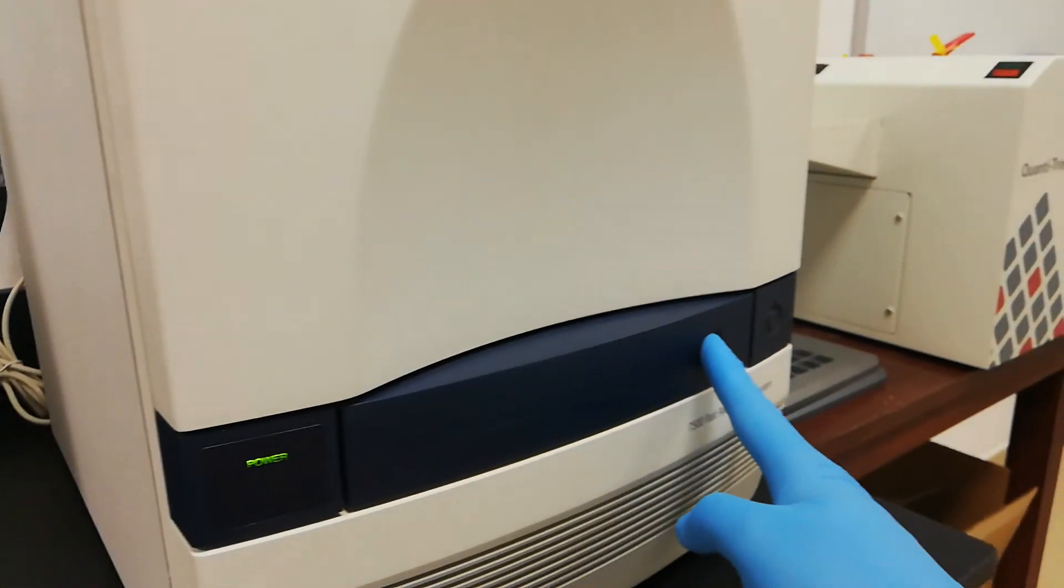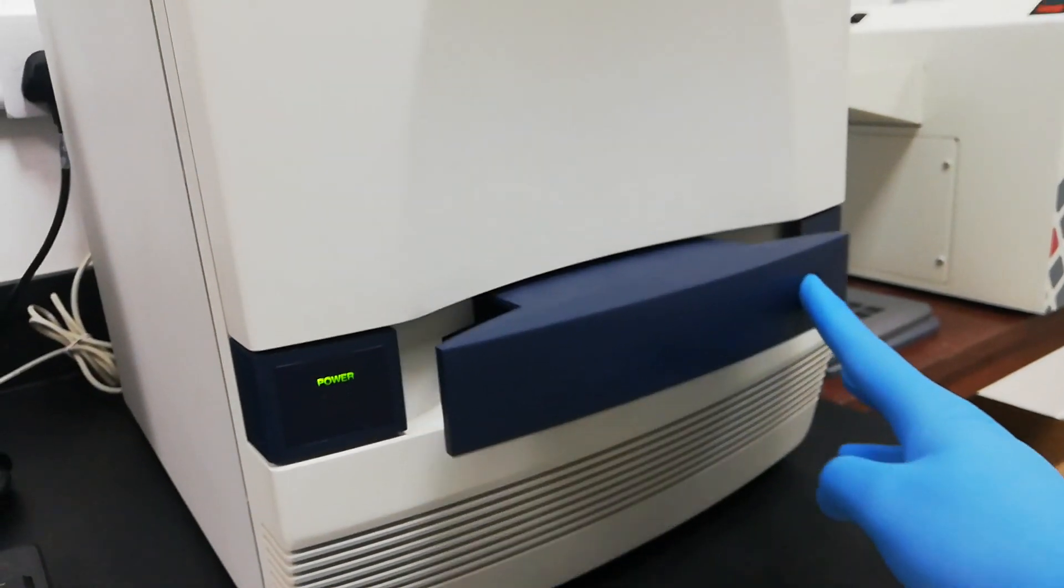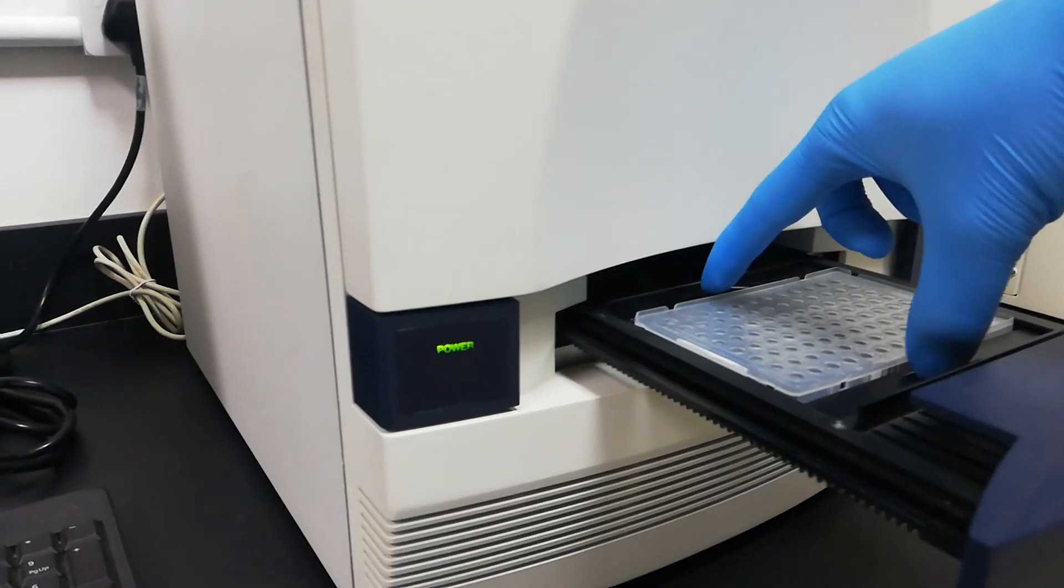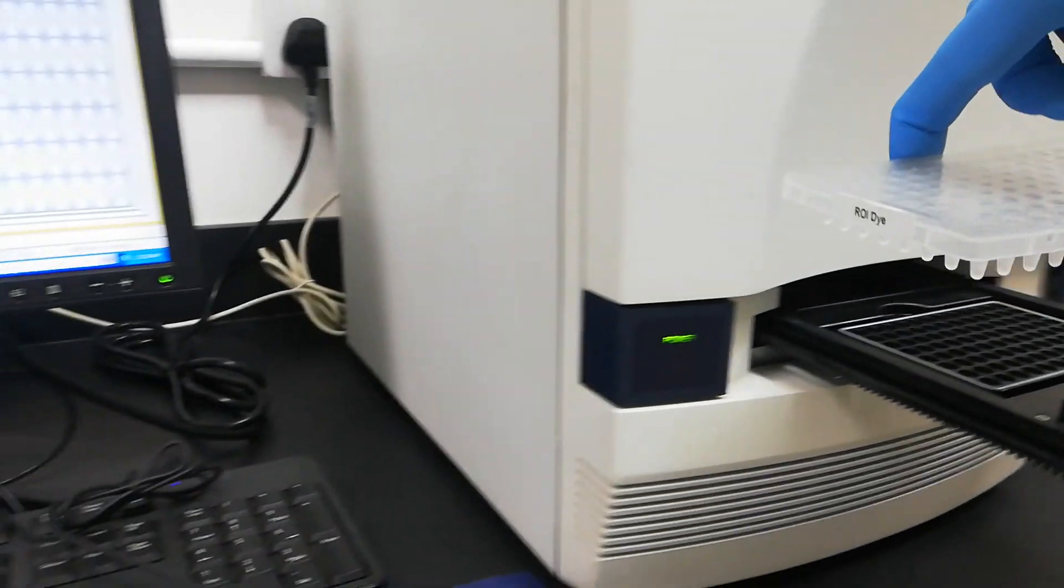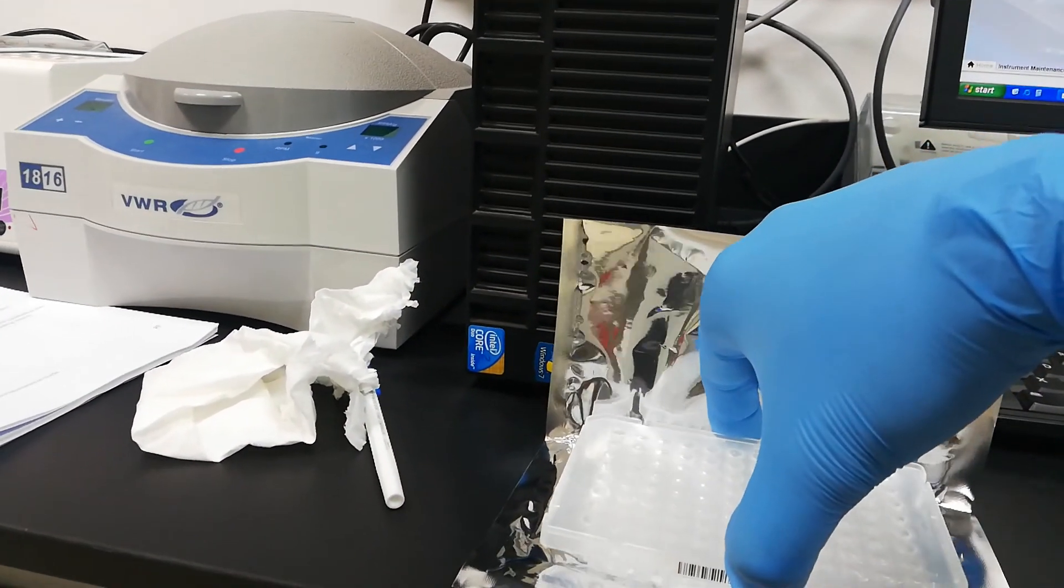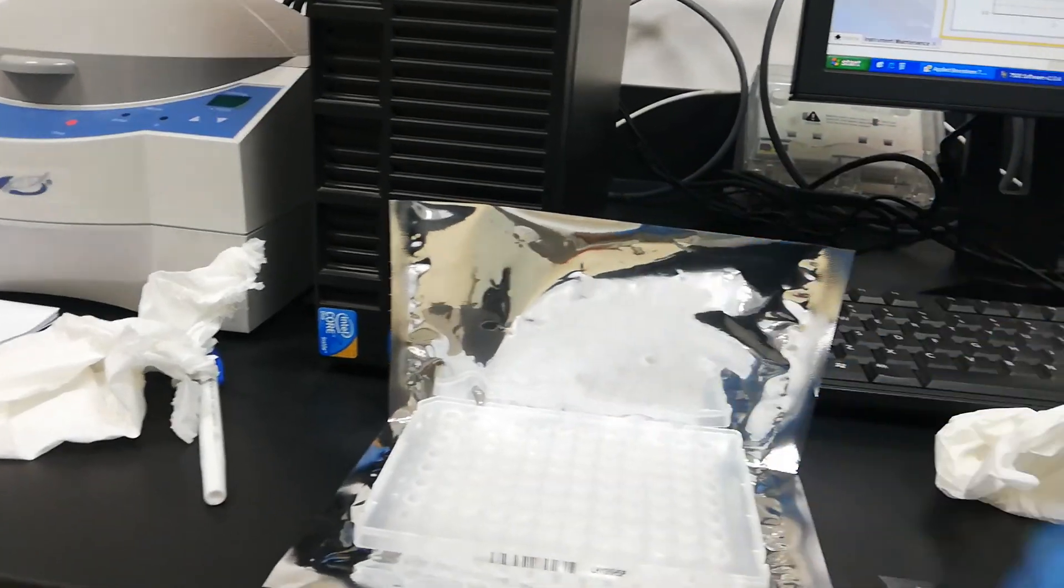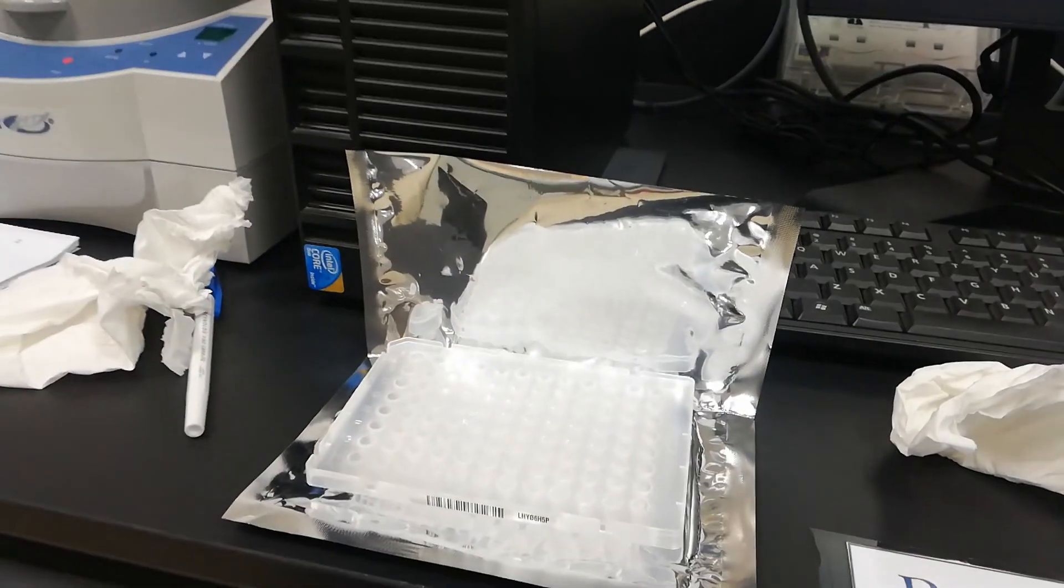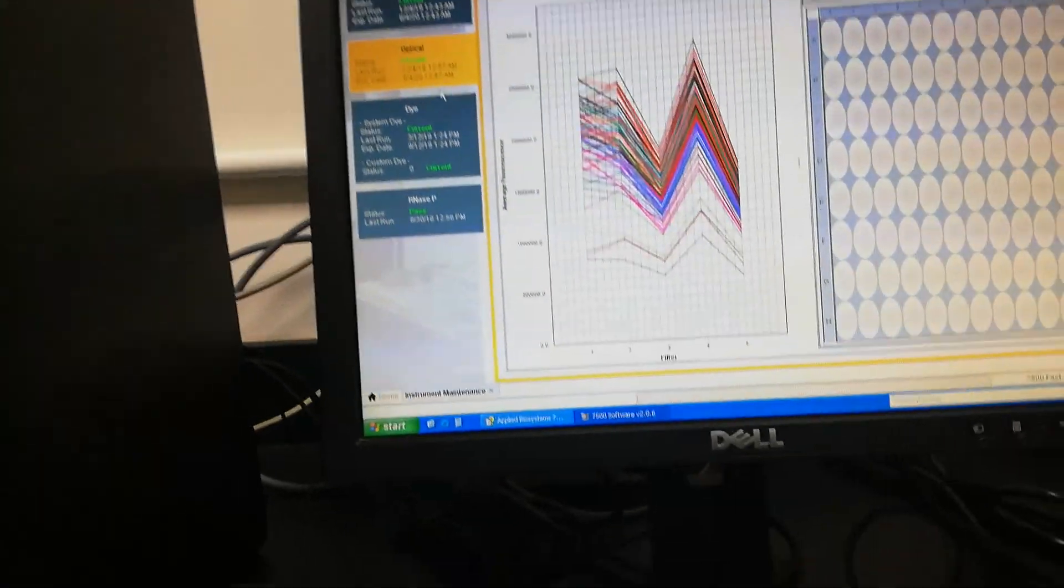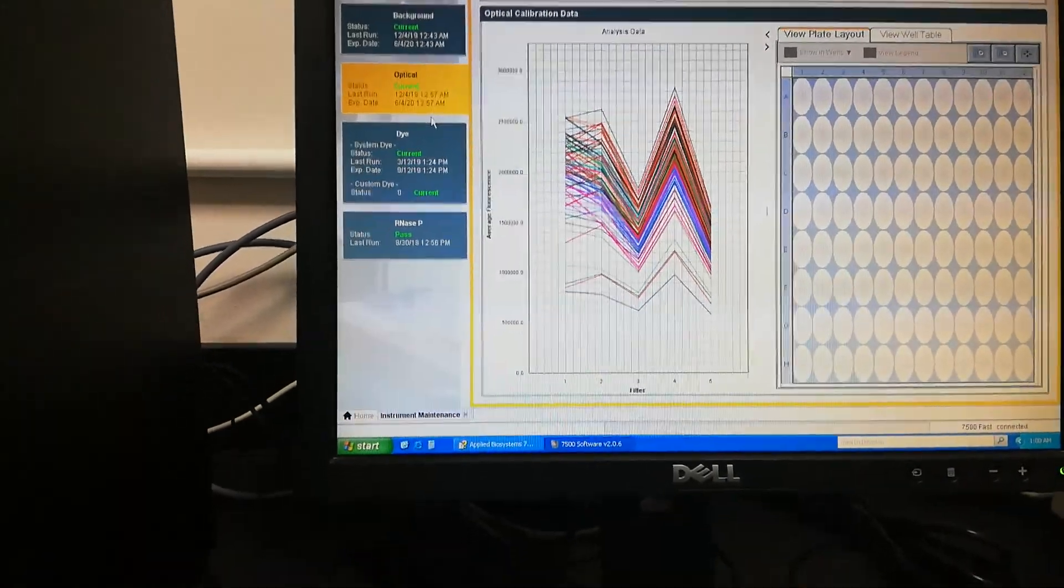Now again, just unload the tray, take out the plate. Do not put these calibration plates anywhere else. Always keep these plates on their packing. Once this optical calibration is done, now we will go for this dye calibration.